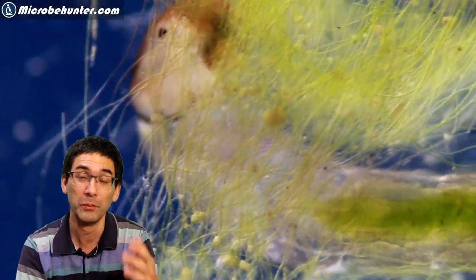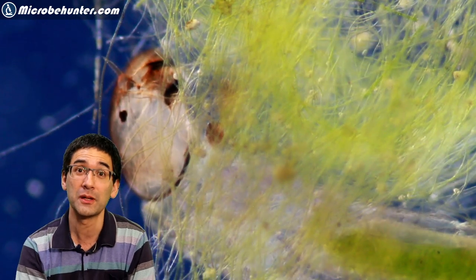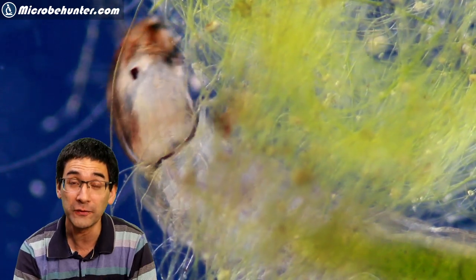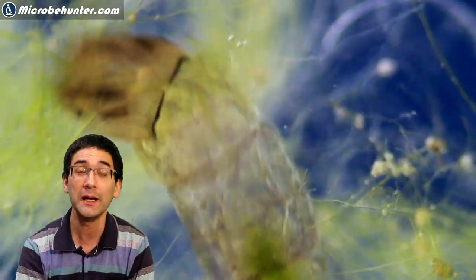Surrounding the larva is a whole bunch of algae. I also found some copepods, which are water fleas, and some other larvae. The biodiversity is quite high.